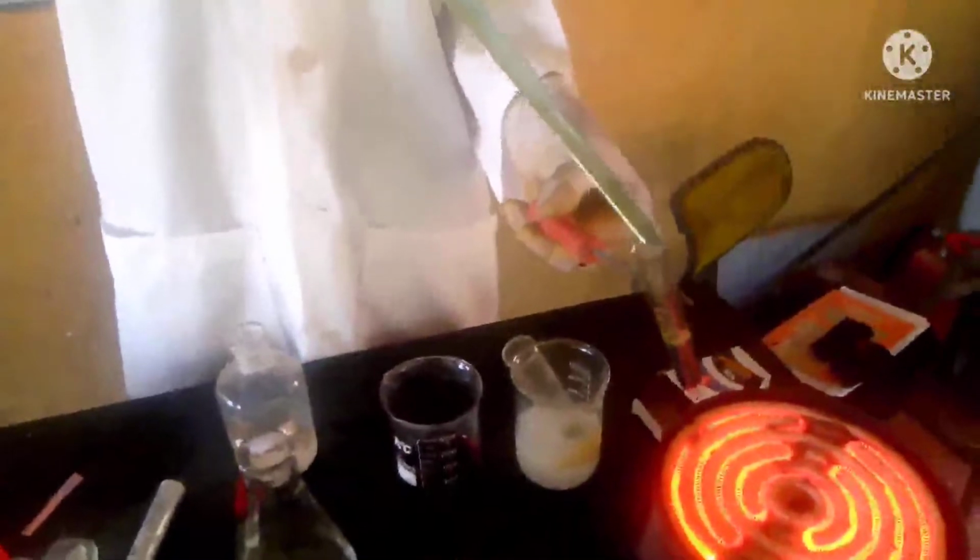And we have this glass rod. I dipped the glass rod inside HCl. When I hold it to the mouth, you see dense white fumes. Okay, so now let's report our work so far.